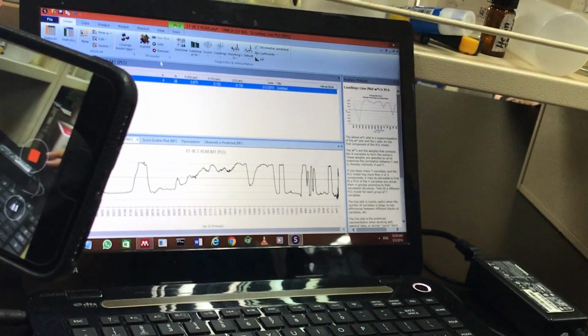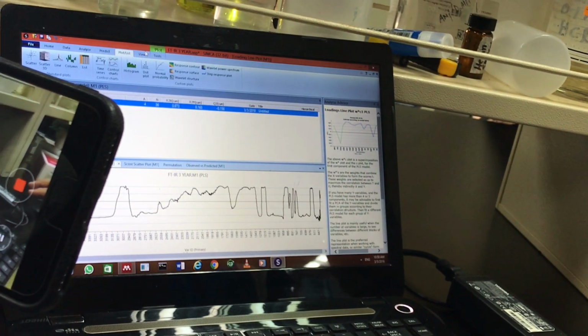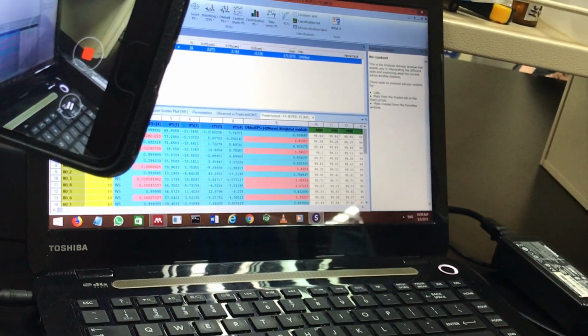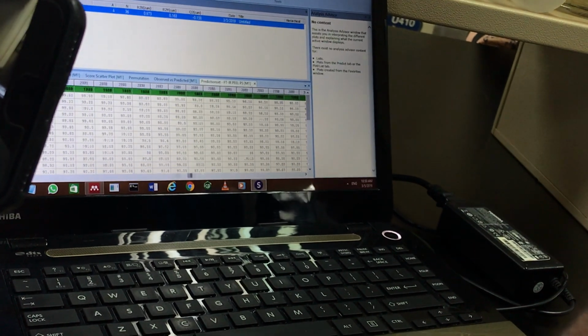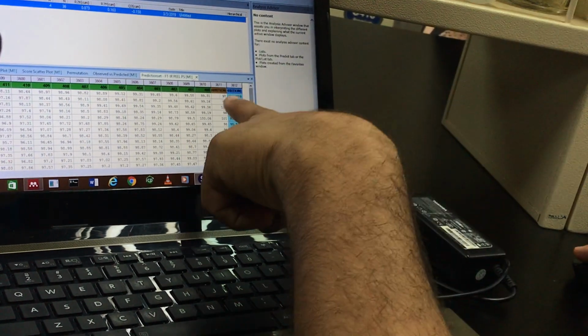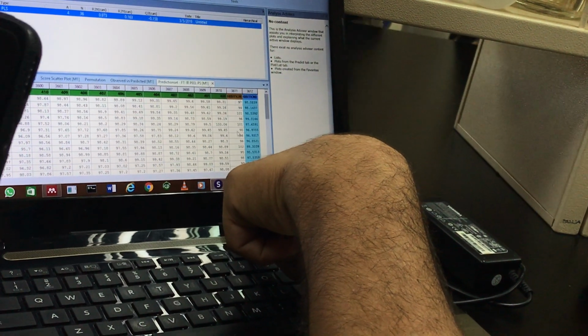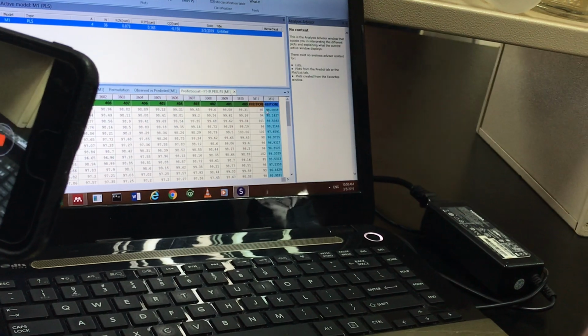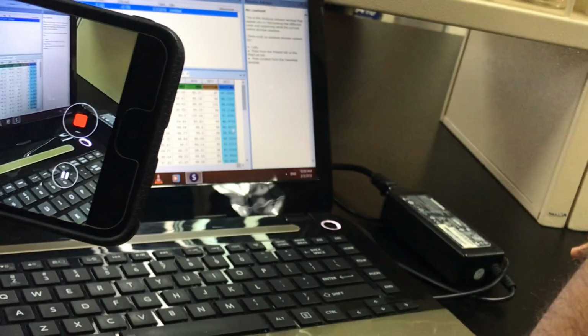You can see here, where does the value come from? From the software. No, the predicted one. Predicted value from the prediction list. Okay. This is the prediction. Even this is the prediction one. This is your result and this is the prediction from the software. Okay, prediction report.